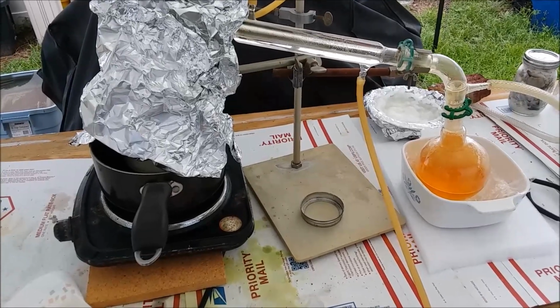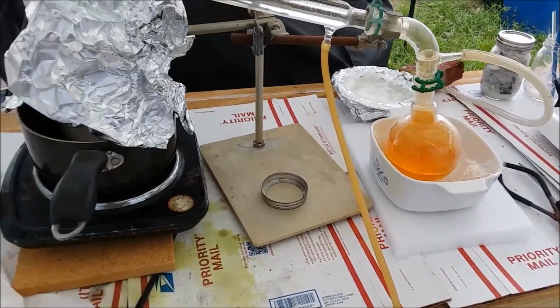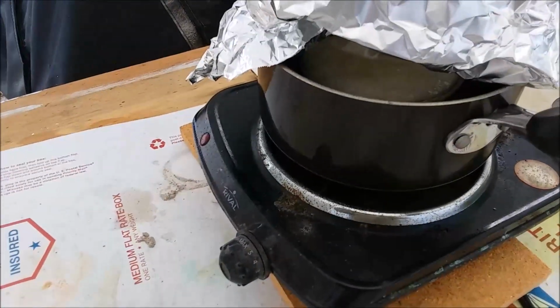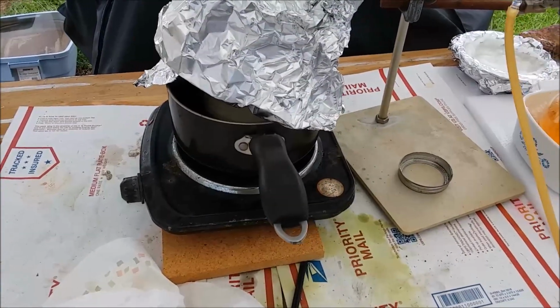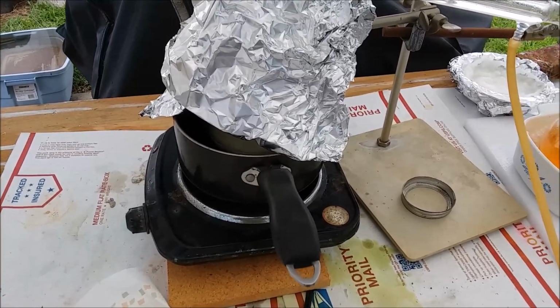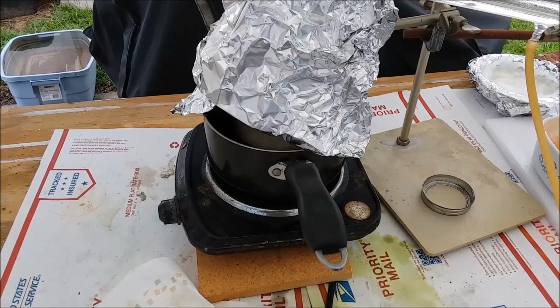Okay, the second distillation's almost done. The drops are coming less and less often, so it's about time to shut this down. I'll do the same as I did with the 2 liter flask. I will dump out the semi-liquid sodium bisulfate, and that'll make cleaning up the flask a lot easier. I won't have to dissolve it all out. I'll just have to dissolve what stays in after dumping it out, which seems to just take a few minutes.